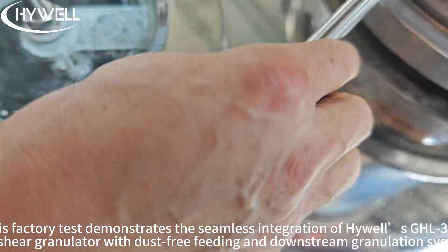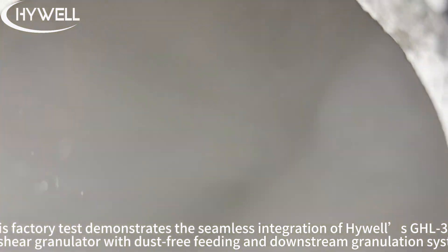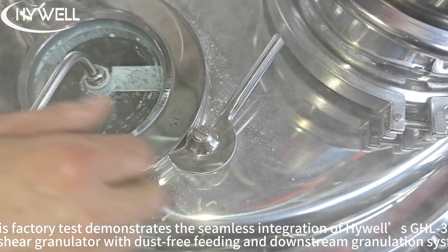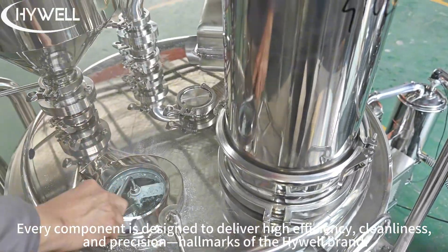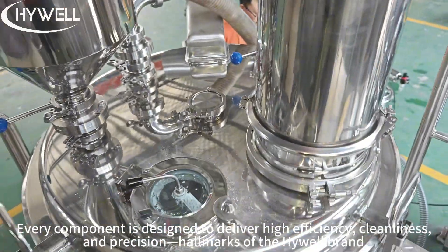This factory test demonstrates the seamless integration of Hywell's GHL300 high-shear granulator with dust-free feeding and downstream granulation systems. Every component is designed to deliver high efficiency, cleanliness, and precision — hallmarks of the Hywell brand.